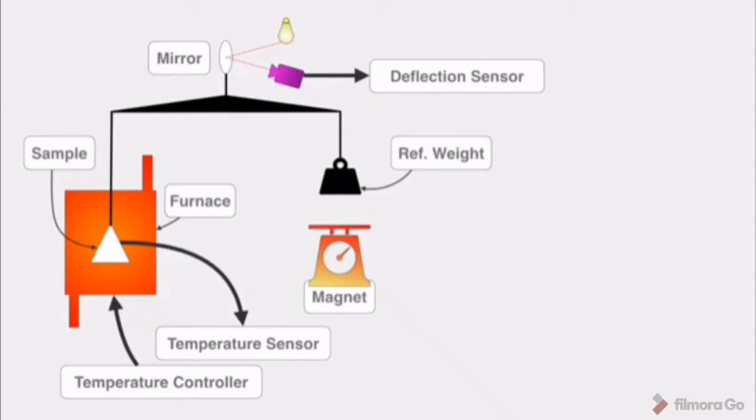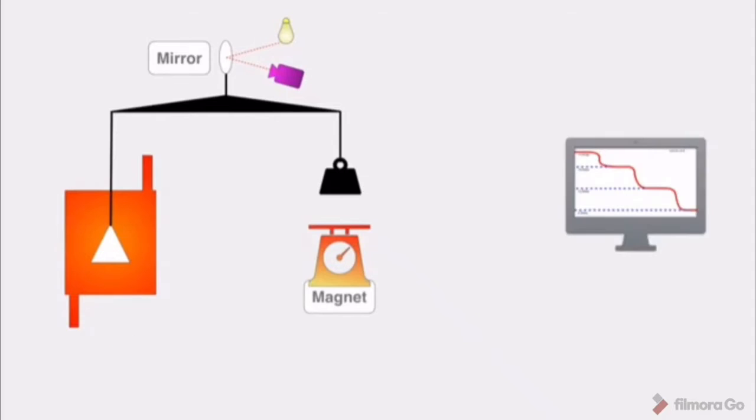The result of thermogravimetry depends on the atmosphere of the sample. The atmosphere should be an inert gas called purge gas, which may be argon or nitrogen. So, let's discuss the working of this instrument.